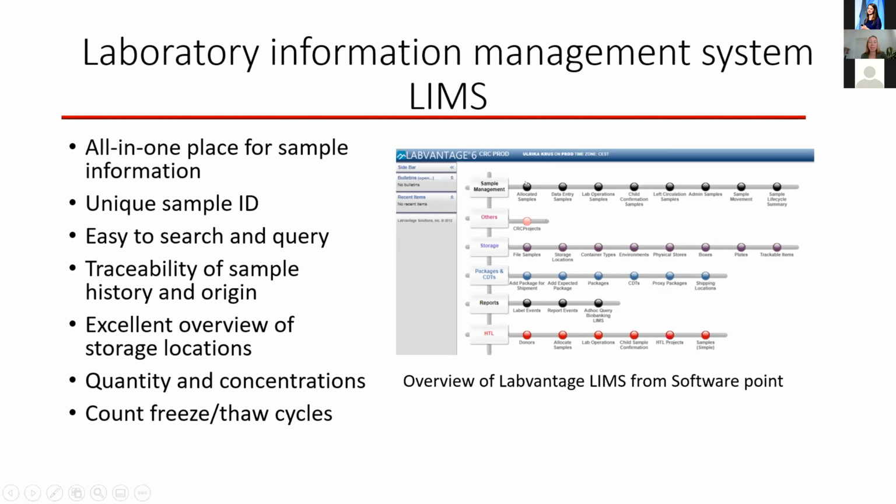This is an overview of the LIMS that we are using. It's called LabVantage from SoftwarePoint. There are, of course, many other systems as well. As you can see here, there are different arms, so you can handle sample management, storage, package, reports, and I have my own arm, which I have designed for myself to make it suit my needs.